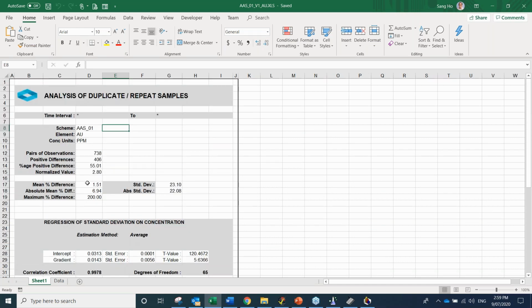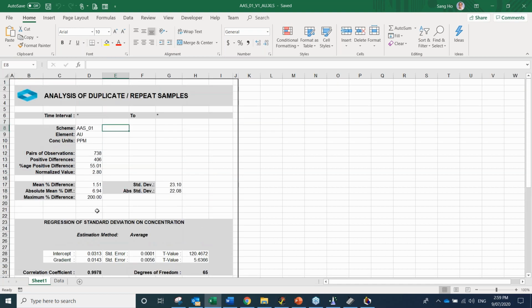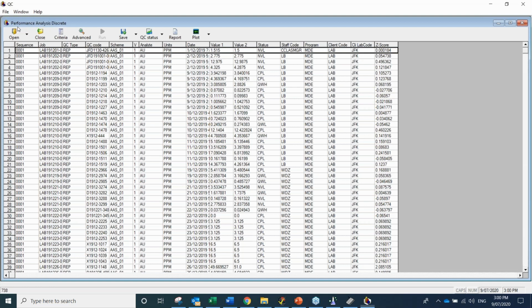However, it's very meaningful for those who are interested in finding out how the lab is doing. And then similarly to the standard case, we have different charts that offer a glimpse into how good we are doing in terms of replicate. Next one is our correlation.